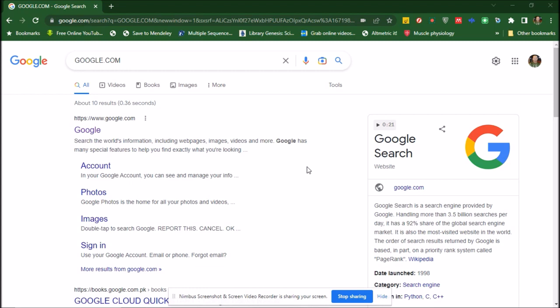Show you how we can extract gene IDs from BioMart. BioMart is one of the most, I would say, revolutionary developments in the field of genomics. BioMart is embedded into Ensembl, and you can extract bulk data. It is one of the most useful tools to extract bulk data from the internet.